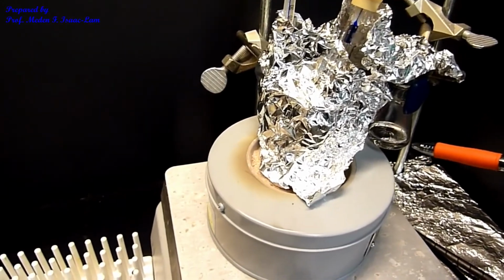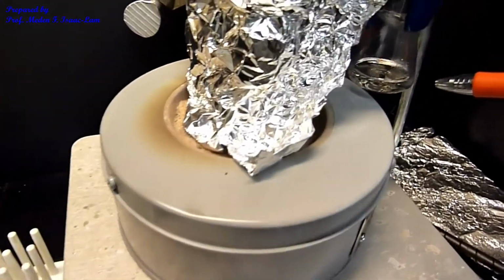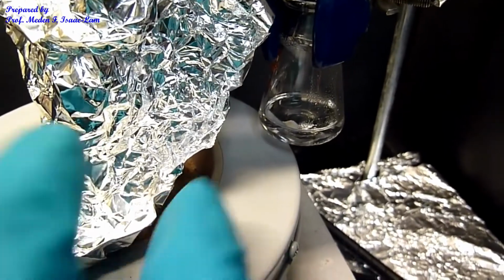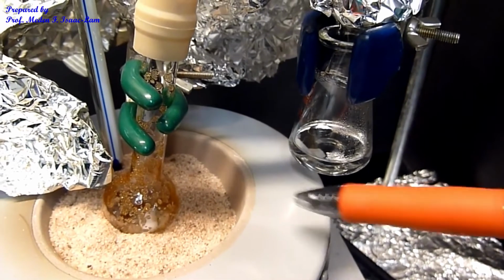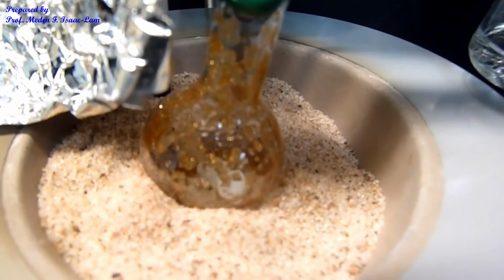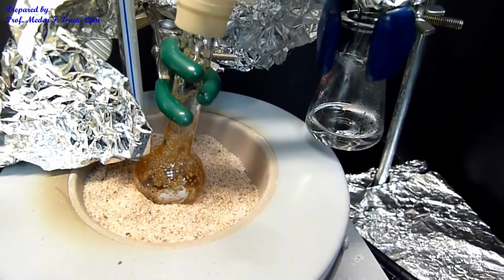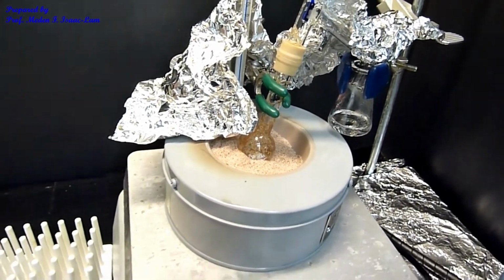So I have here the distillate. This is the distillate, and it's almost done. If you look at the residue, it's almost down to the bottom. So I'm going to stop it now. Okay, so it's done. I'm going to turn it off. Turn off everything, including the transformer. So I'm now going to disassemble, and I'm now going to do the next step.